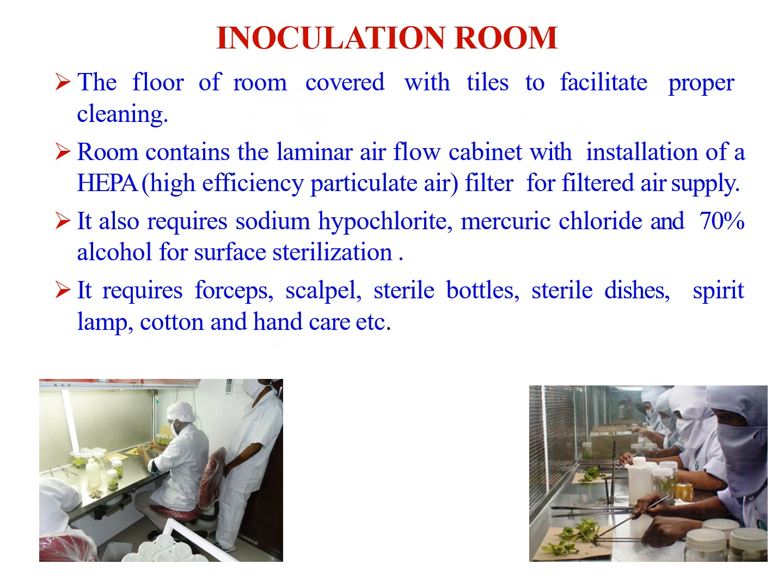An inoculation chamber is nothing but where we are going to inoculate our culture, the initiating stage. There should be a laminar airflow chamber, and also it has to be air conditioned. It should have shelves or racks to keep forceps, scalpels, sterile bottles, and sterile dishes, and the spirit lamps, cottons, and gas connection should be provided.